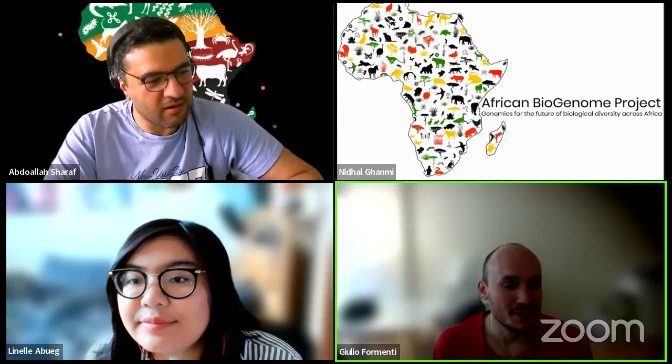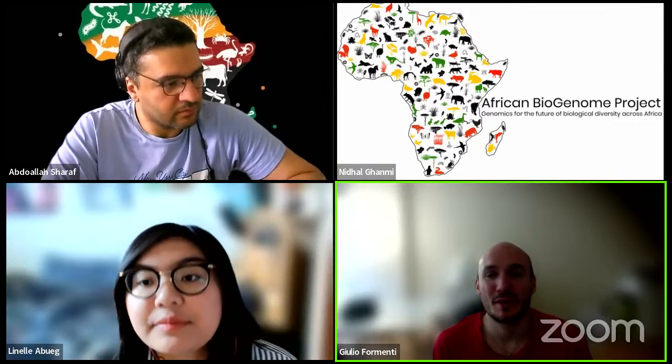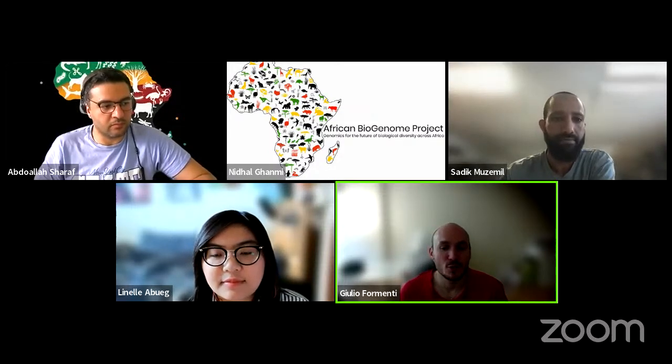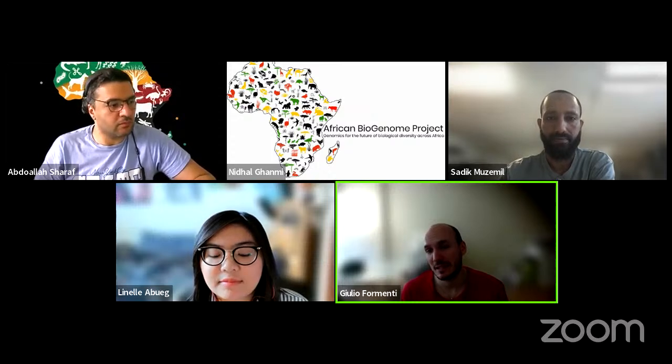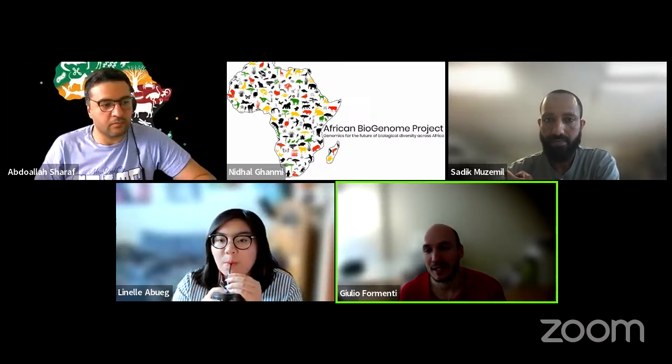So maybe I can answer that. The BlobToolKit is a very nice tool. The problem is that we want something that is automated, while BlobToolKit is more of a visualization tool that can potentially allow you to disentangle some of the contaminants from the rest of the assembly, but will not give you a straight answer like, this is what we think is contaminant, get rid of it. You need to visualize; they have these plots of GC content and coverage. Then it's really up to the user. But if you have time to manually curate your assembly, then it makes sense to run something like BlobToolKit to further refine your results.